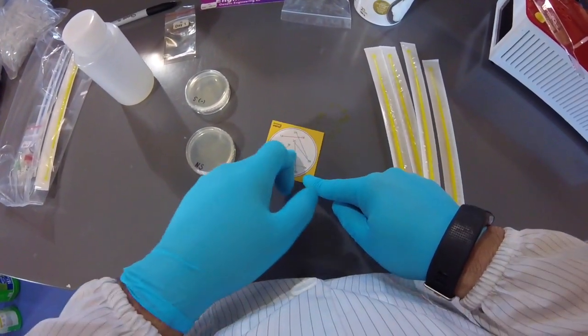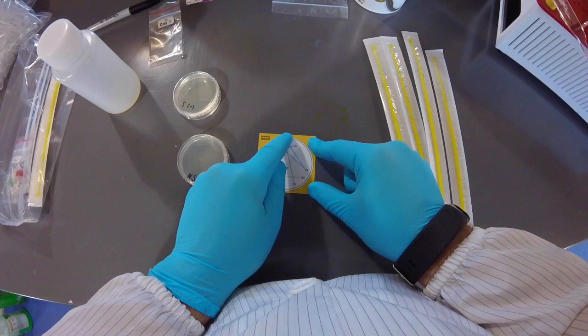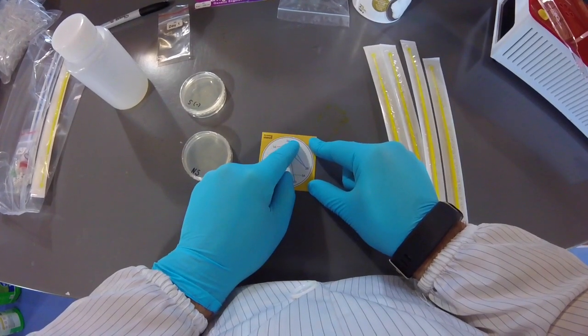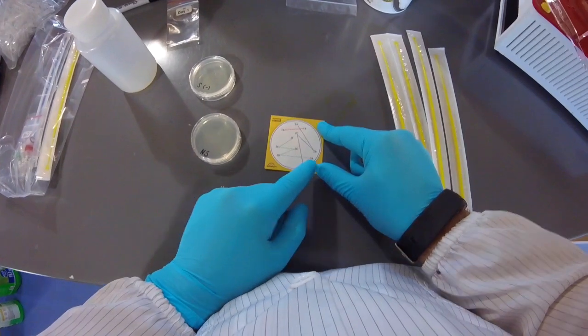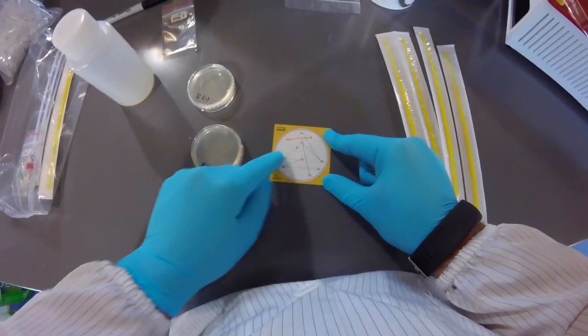Drag it through the second line and then do a few zigzags. Okay, and the idea is that because on the second line here, you're only dragging through this small part of the first line right here, you're only collecting a small number of cells and then you're spreading them out through a larger distance. And then even more so on the third, you're dragging through the second line, so even fewer cells, and then streaking them out, okay?